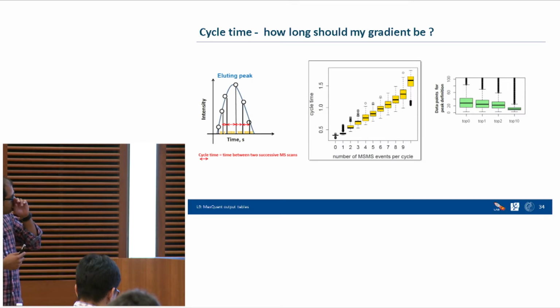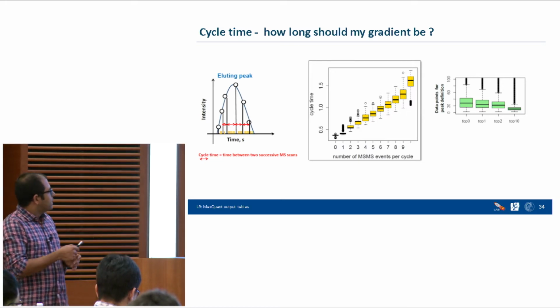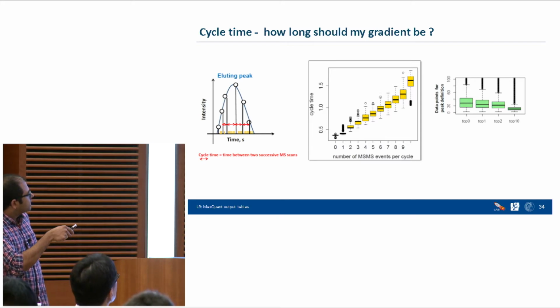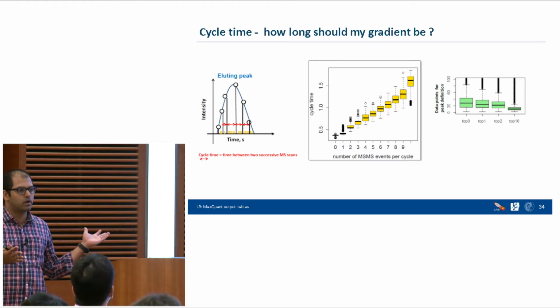Right, so this is actually from the MS scans table. I will try to explain this. If a peptide is eluting along the retention time scale, each circle here is one full MS scan. So in this case we actually have 1, 2, 3, 4, 5, 6 snapshots of this particular peptide, and probably this is too few.